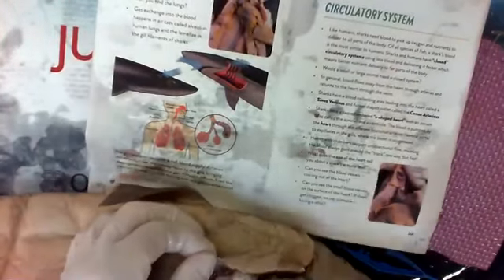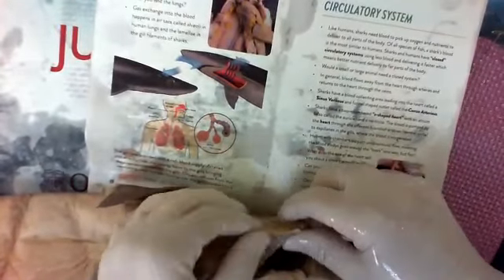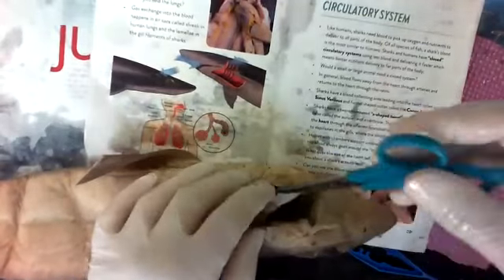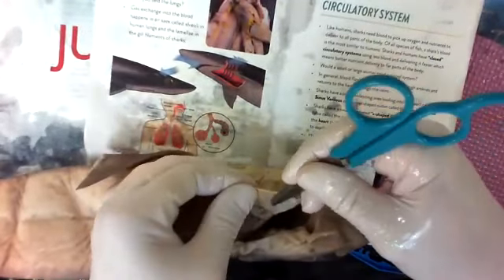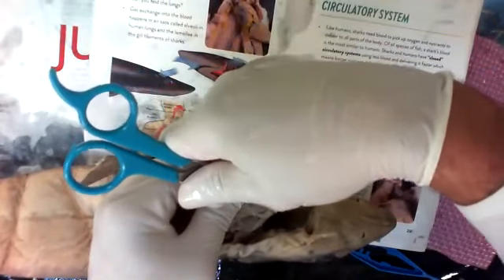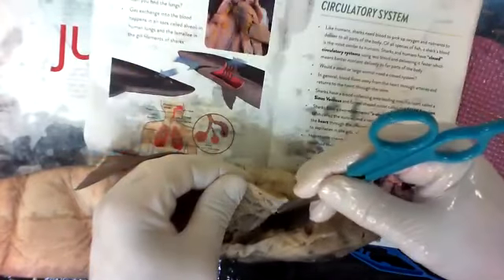All right, so there you can see the gills. We saw the gill rake that prevents that. Where you cut through here, the jaw, you feel that's not bone, that's jaw, and it's actually cartilage. What's kind of cool about the cartilage is that it's kind of translucent. You can see through it. So if I put something behind it, I can actually see the outline of the scissors as they move back and forth. Whoops, sorry, like this. There's the cartilage.